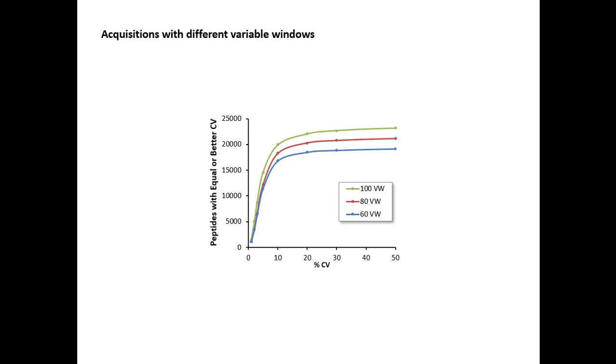And then, of course, when you re-import your DIA data into Skyline, you have to tell it what isolation scheme you were using, right? So you have to remember. That's why I'm just happy with the one method. I don't know how much you change your window setup. Not so much. I have different methods for phosphoproteomics than for normal proteomics. Other than that, I don't really change that much, but I have tested a bunch of settings.